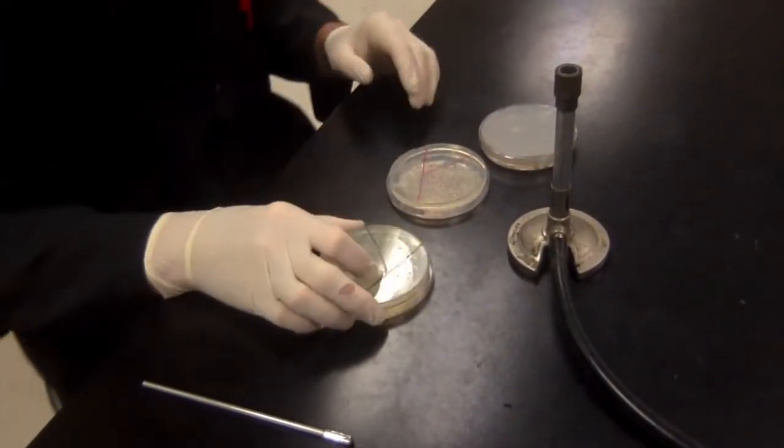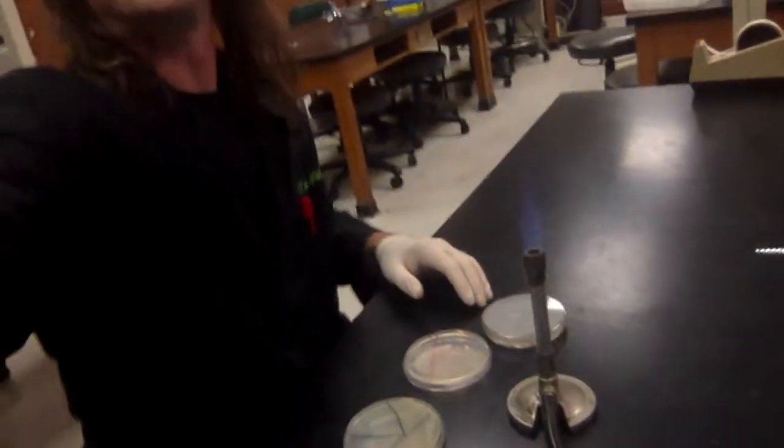This is the routine way that microbiologists isolate clonal populations of organisms — the way we get colonies to work from. You'll be doing this once a week with your isolates all semester.